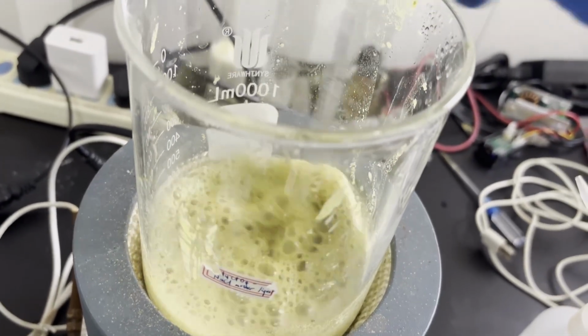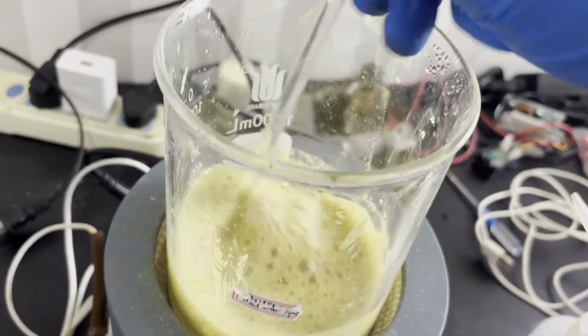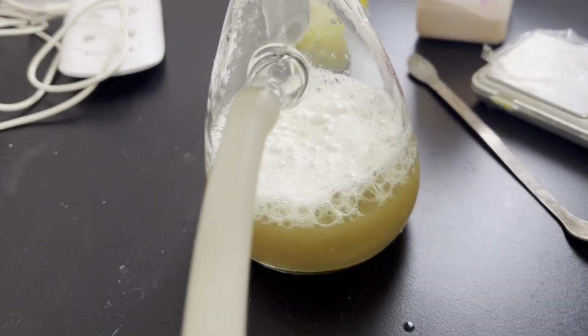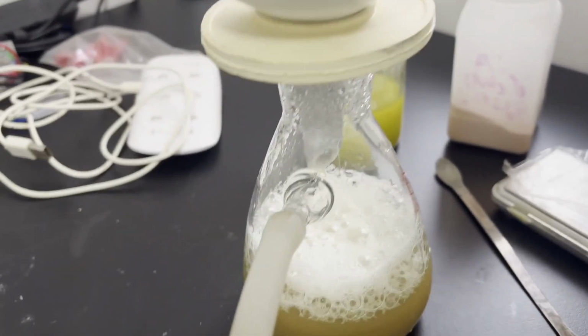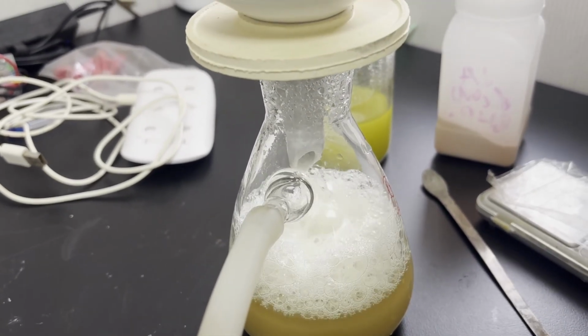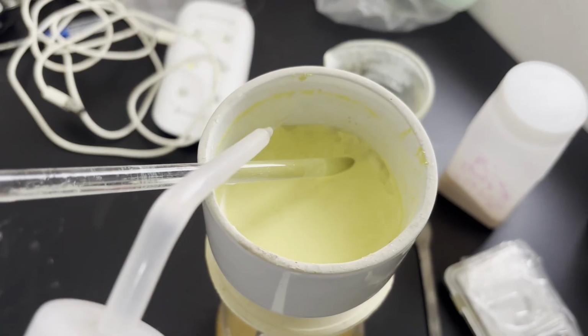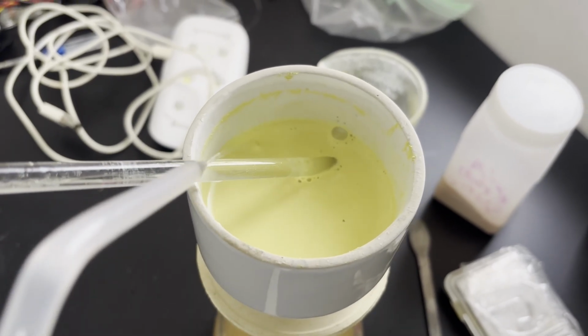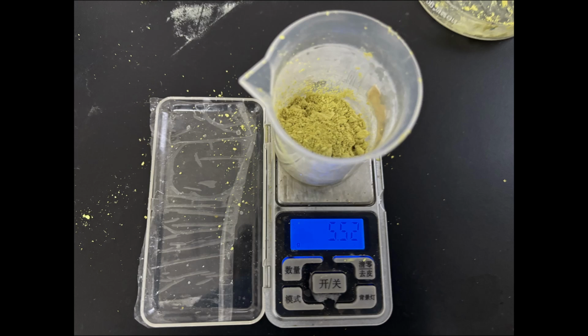After bringing this mixture to a boil for another 5 minutes, it is again filtered. The filtrates of these two procedures may contain a small portion of acridone product as well as unreacted N-phenylanthranilic acid, but it is not worth recovering. The acridone is washed with some water 3 times before finally being dried in air. The final yield of crude acridone is 5.52 grams, representing a 60.3% yield.